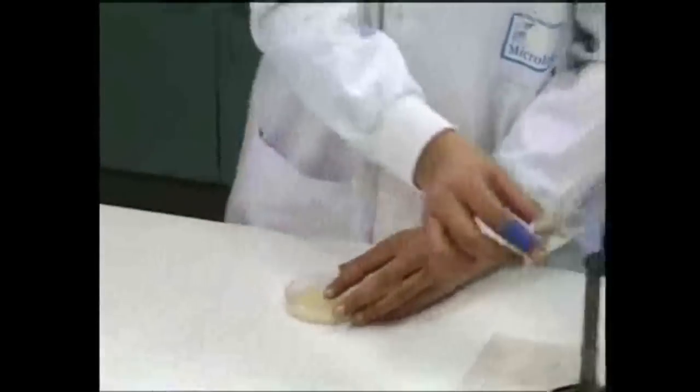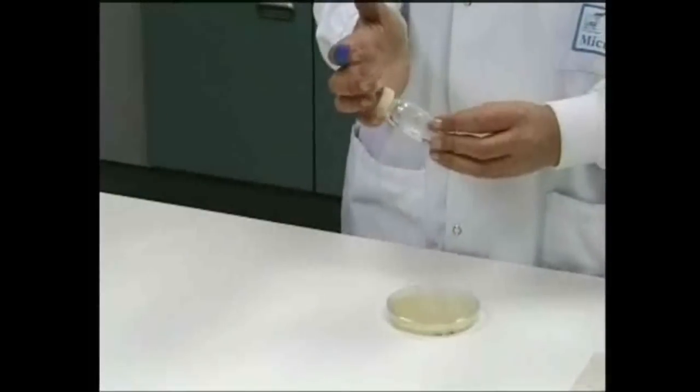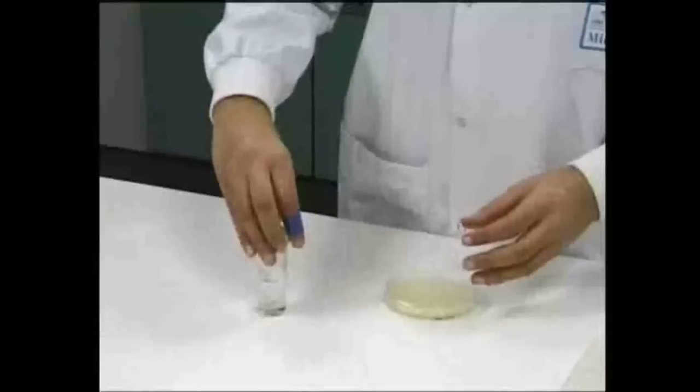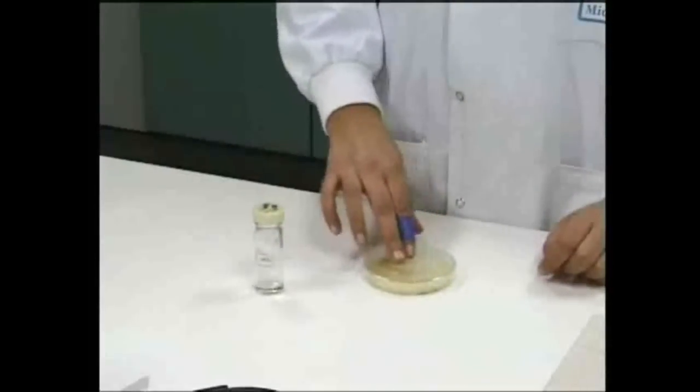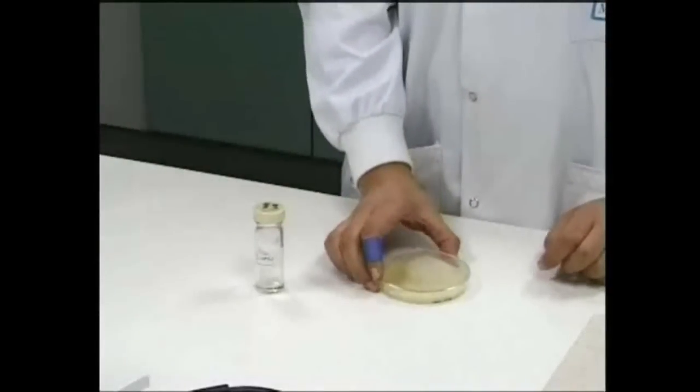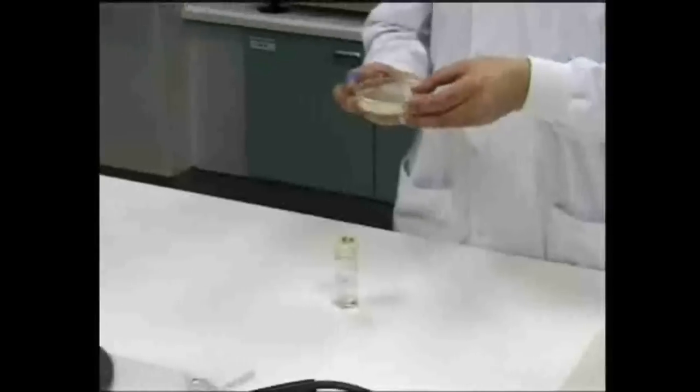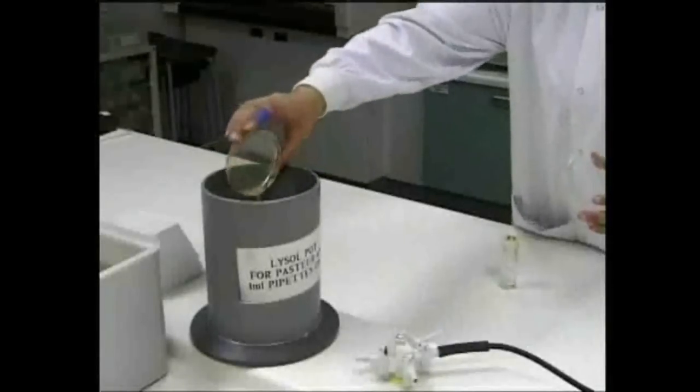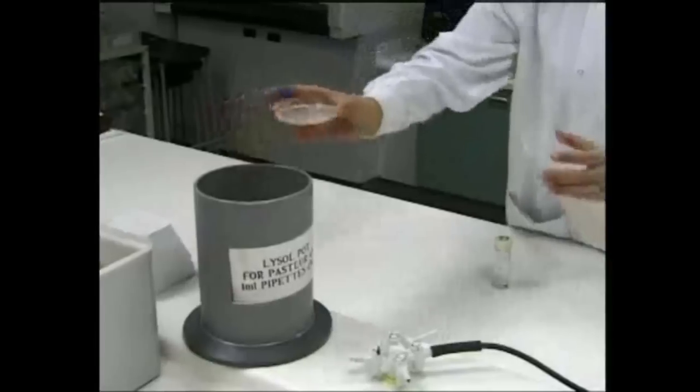The plate is then swirled, allowing the culture to cover the agar completely and to distribute the bacteria evenly. Any excess culture is discarded by tipping it into a solution of disinfectant. The plate should then be left to dry before incubation.